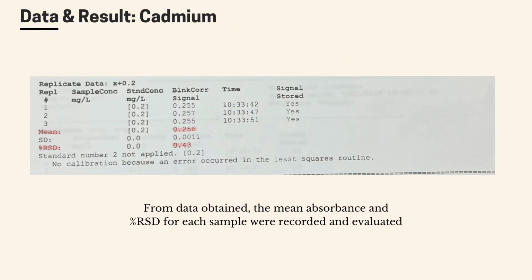Next, this is the data for the cadmium. So from data obtained, the mean absorbance and percent of RSD for each sample were recorded and evaluated.